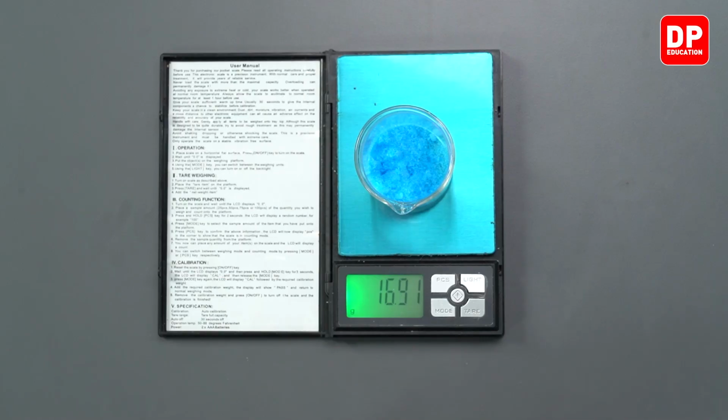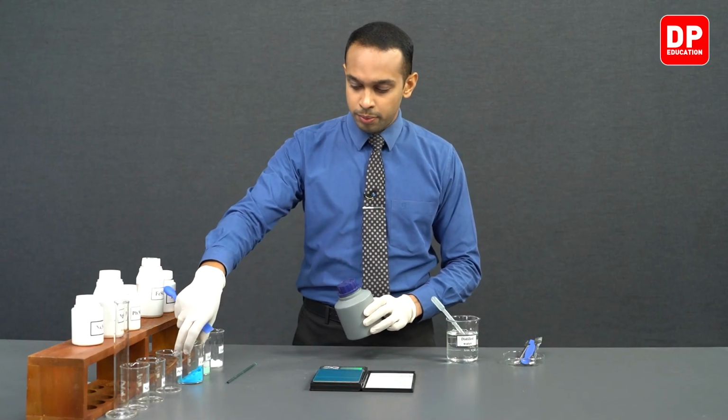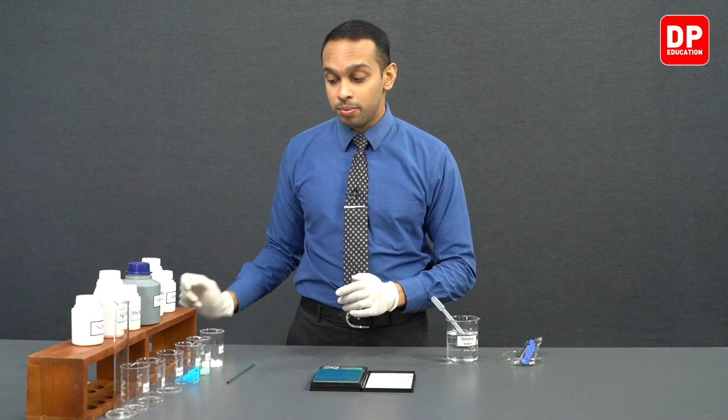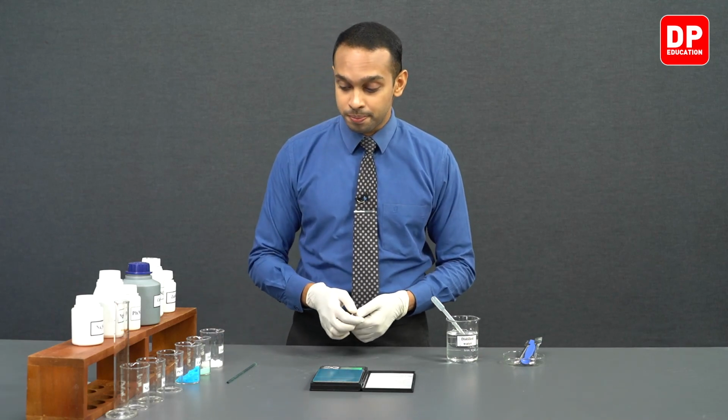We have measured 16.91 grams of copper sulfate. After measuring the relevant mass, we will keep the beaker aside. And as I mentioned earlier, we will be adding water to each of these solutions later on.